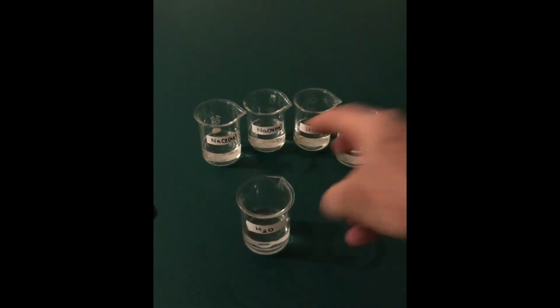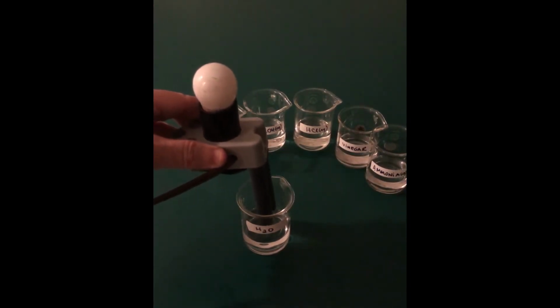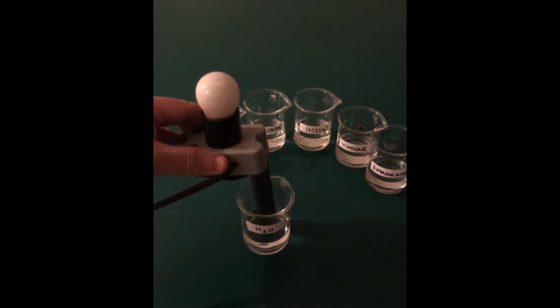And as expected, if I test this against distilled water, in other words, water from which all of the salts typically present in tap water and the chlorine and everything have been removed, of course, I don't get any conductivity. However, if instead of that I have a solution of salt, sodium chloride, our good friend, when I probe it with this, wow, the light goes on very bright.